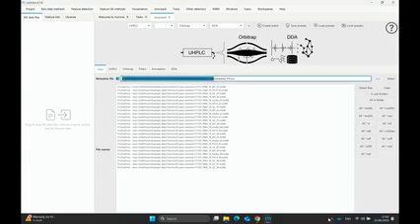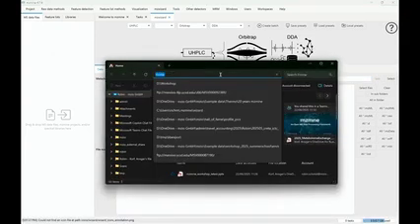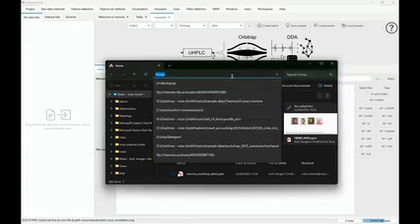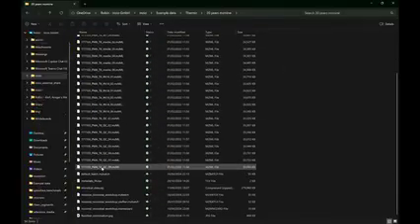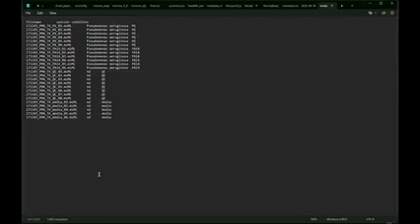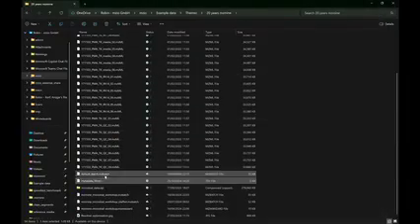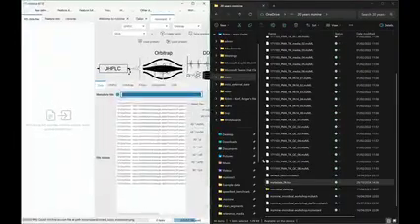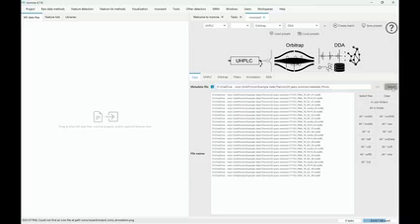Okay, so if it's zipped, you have to, of course, unzip your file first because we cannot read your metadata file from there. But the metadata file just contains, let me see, it's just a TSV file or CSV file, so a table with metadata with the file name and the species and condition of the samples. So we're going to load this one. If we have the file explorer, I can just drag and drop it into this box. But honestly, maybe easier, you can also just go on select.